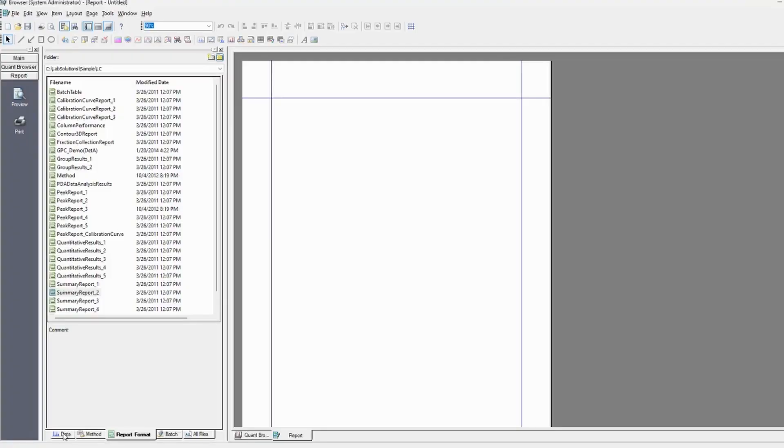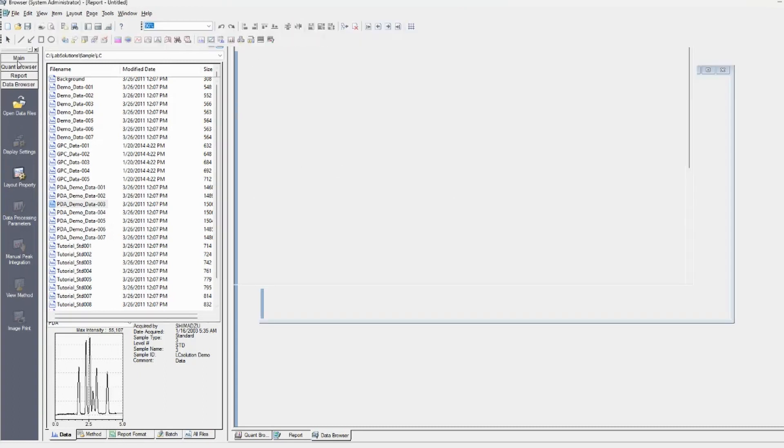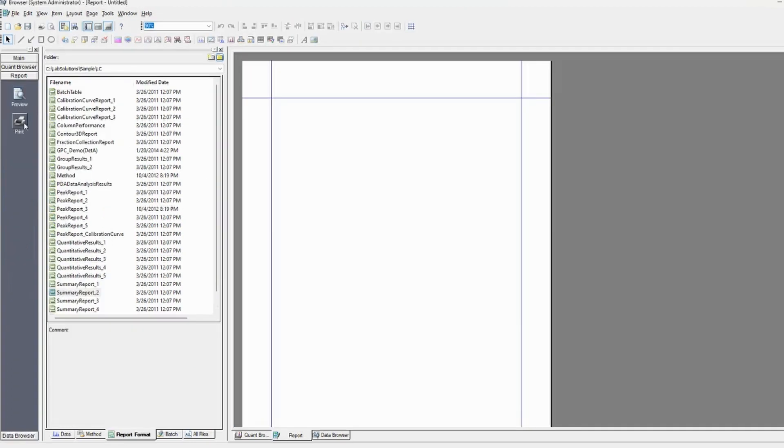Over here we're on the report format page. If you don't know how to get there, data browser, and over here you can click report and you'll be in the report section. There's also these tabs on the bottom here.